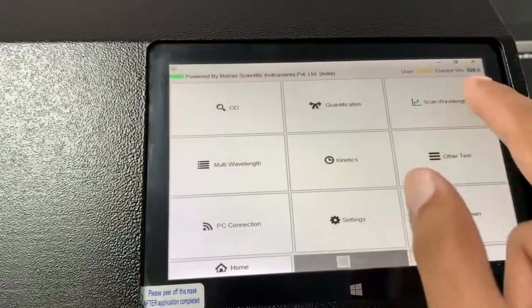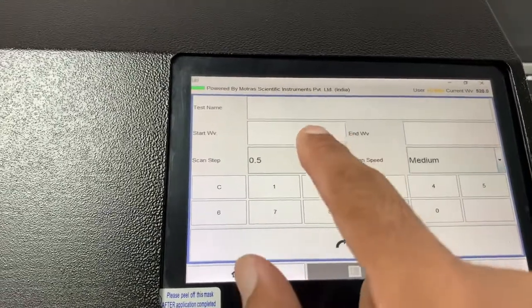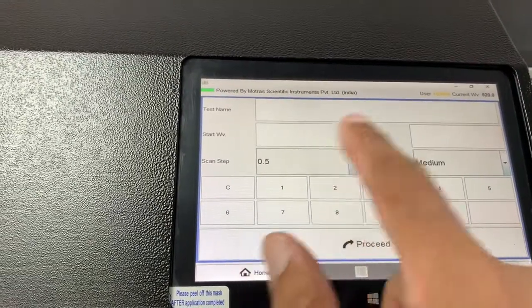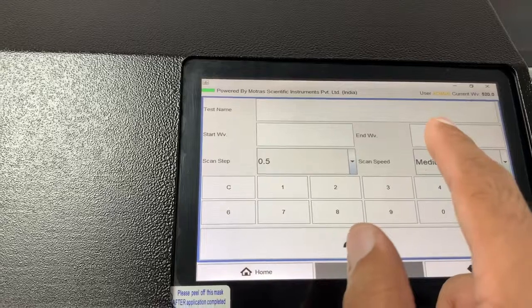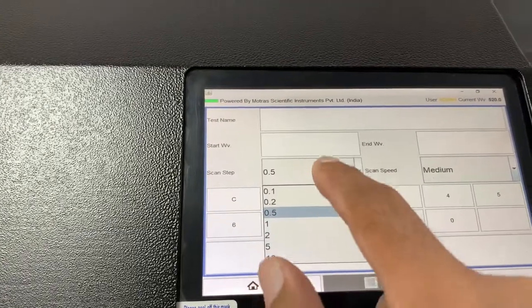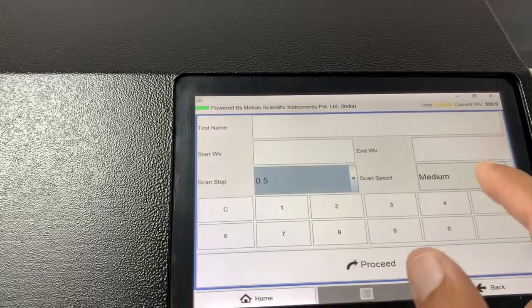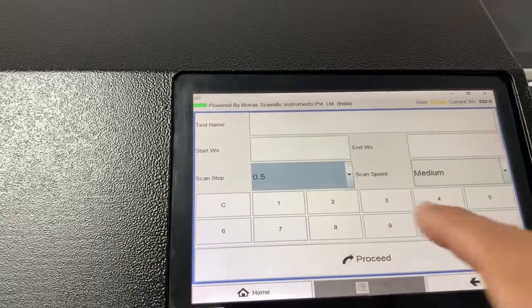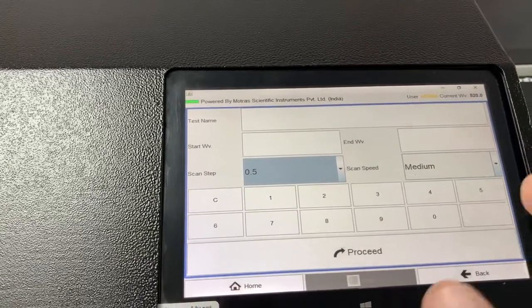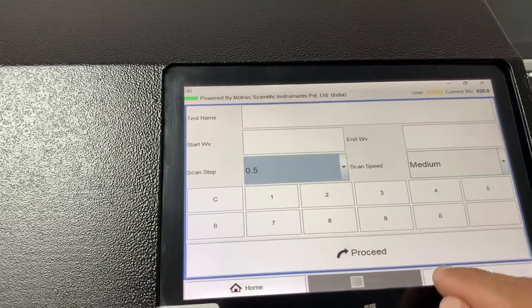Then we have scan mode. Here we put the start wavelength, the end wavelength, the scan step, the resolution of the wavelength, and the scan speed, and we go to the next screen for the actual scanning.